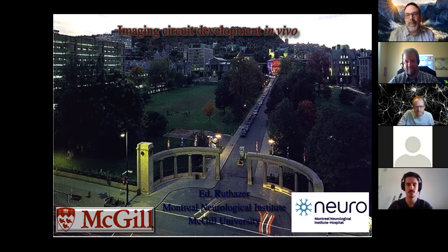What I'm going to tell you about is some of the methods and techniques that we've developed for doing imaging in the brain, mostly in Xenopus, but a little bit in zebrafish. The goal here is that it's a system which is really accessible. Anybody can set it up in their labs. It's not actually very expensive, whether it's zebrafish or Xenopus. There are different advantages to the two systems. I'm going to do a pitch for Xenopus here, to catch you while you're still early on in your careers.